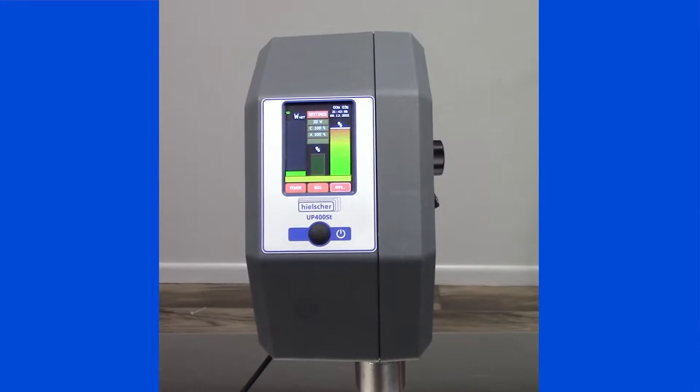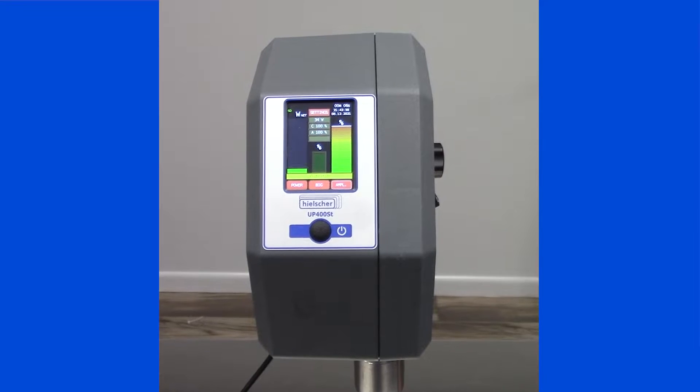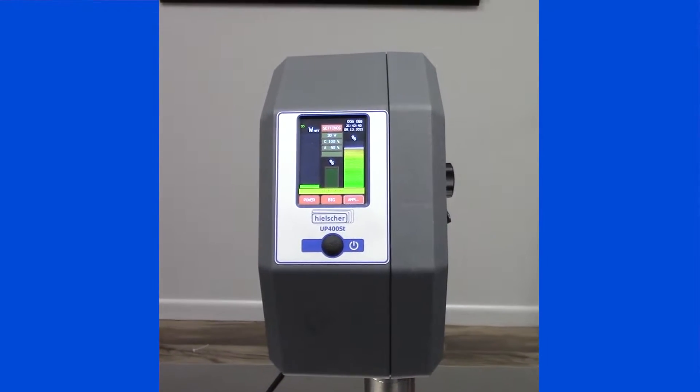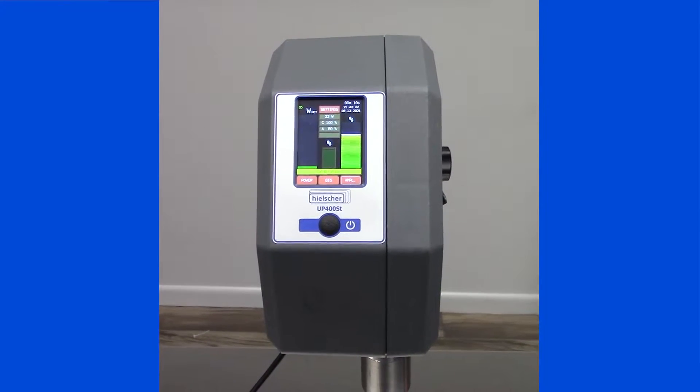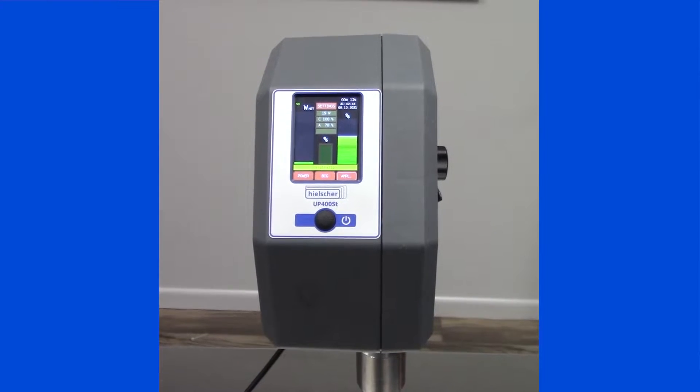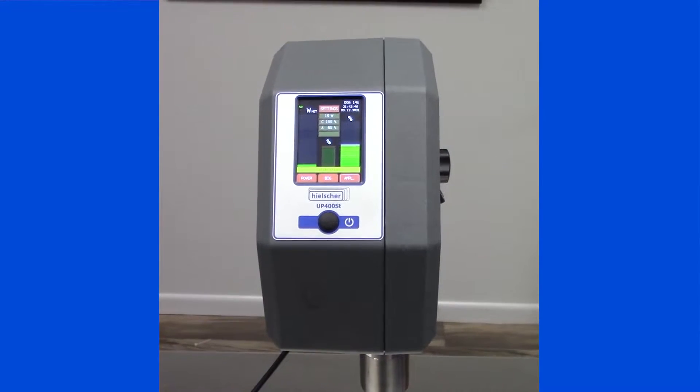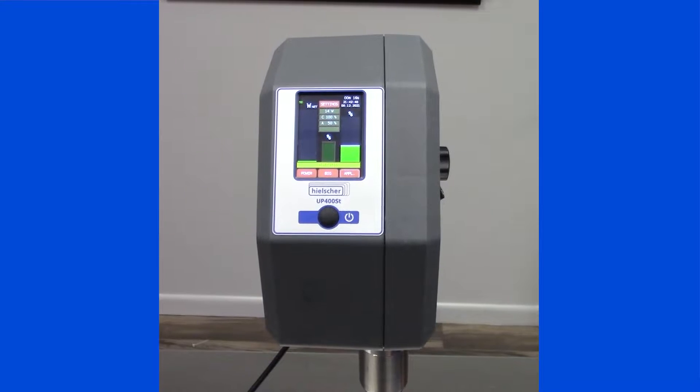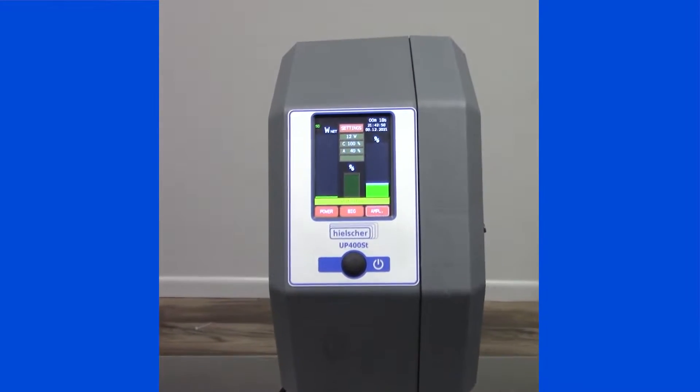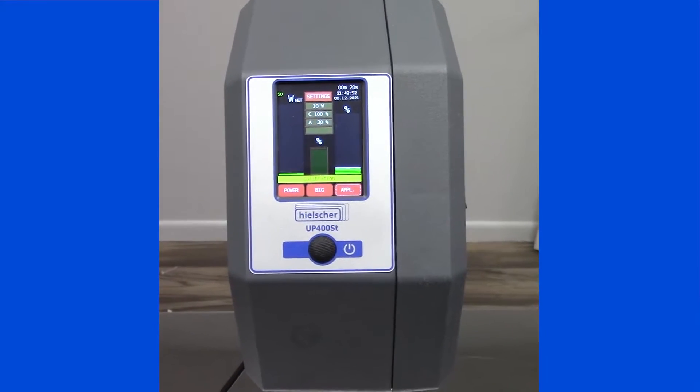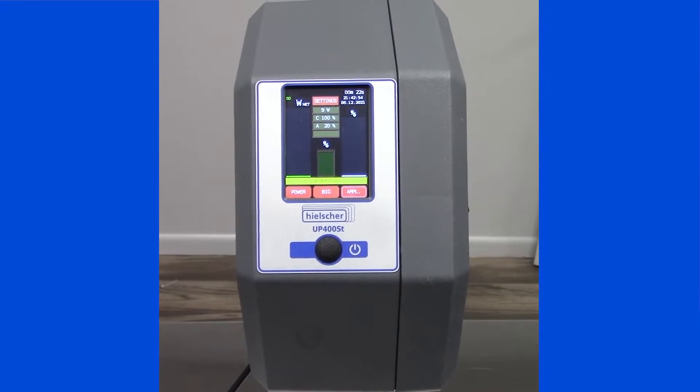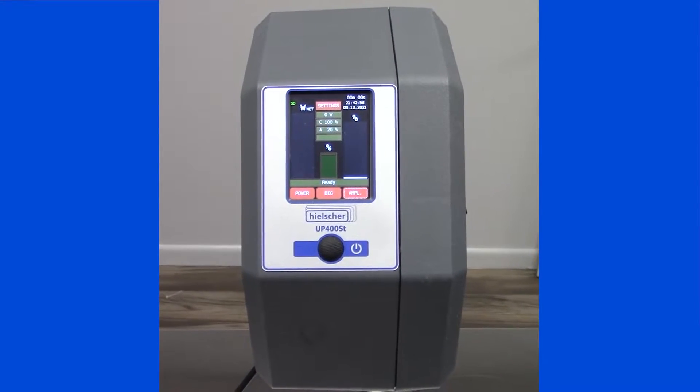Calibration of the unit is critical to determine the net watt value. The net watt value is the amount of energy that is actually being transferred into your product. The net watts are different, for example, when sonicating oil or sonicating water. And the self-calibration is now complete.